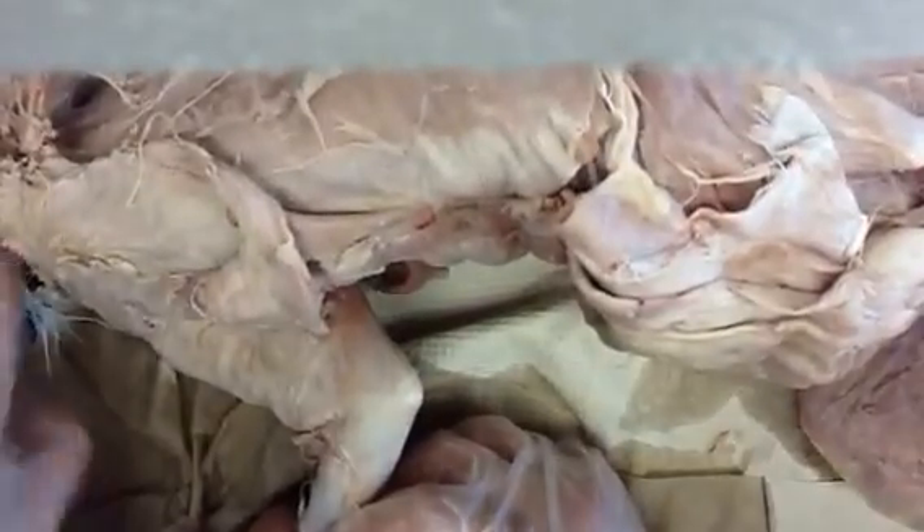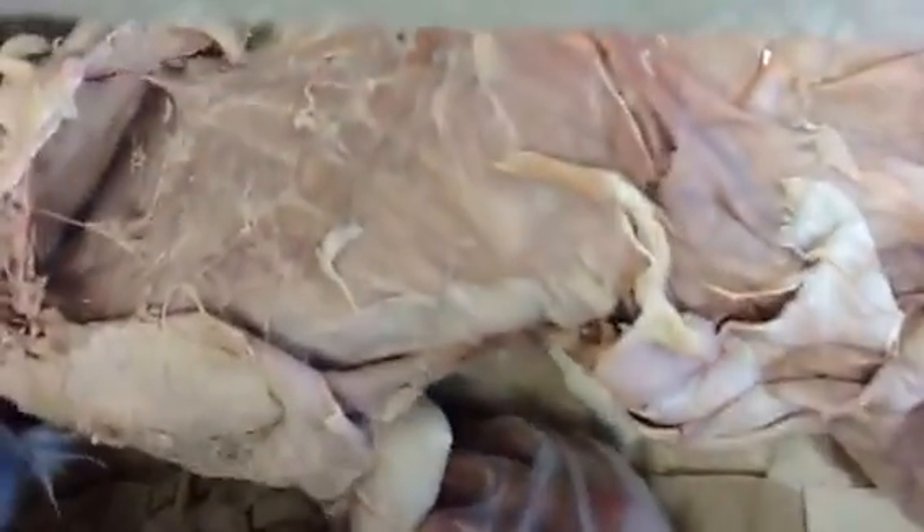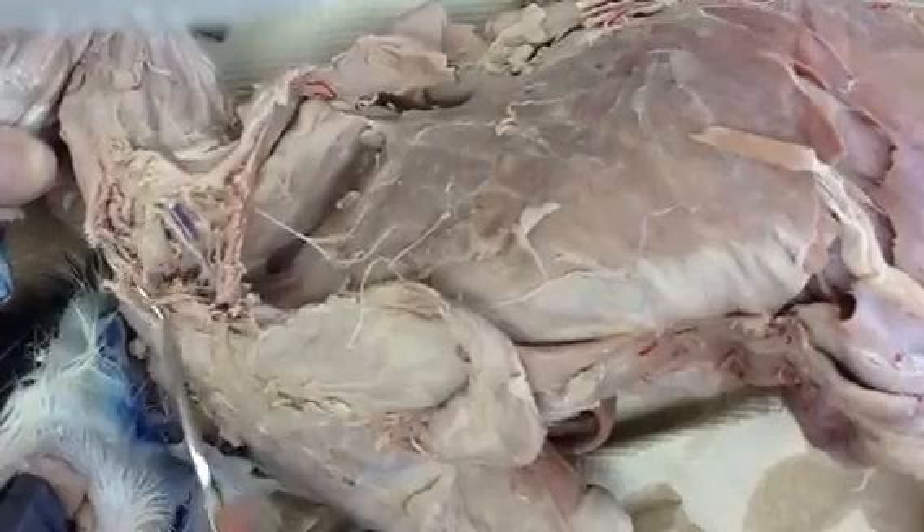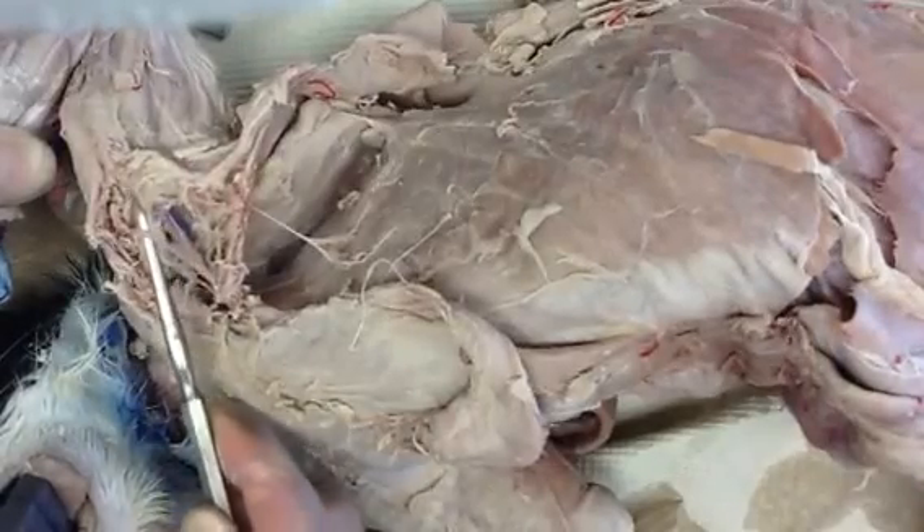We are looking at a brachial plexus. The brachial plexus is over here — slide the camera that way. Here's the brachial plexus, and what you'll see is numerous nerves in here.